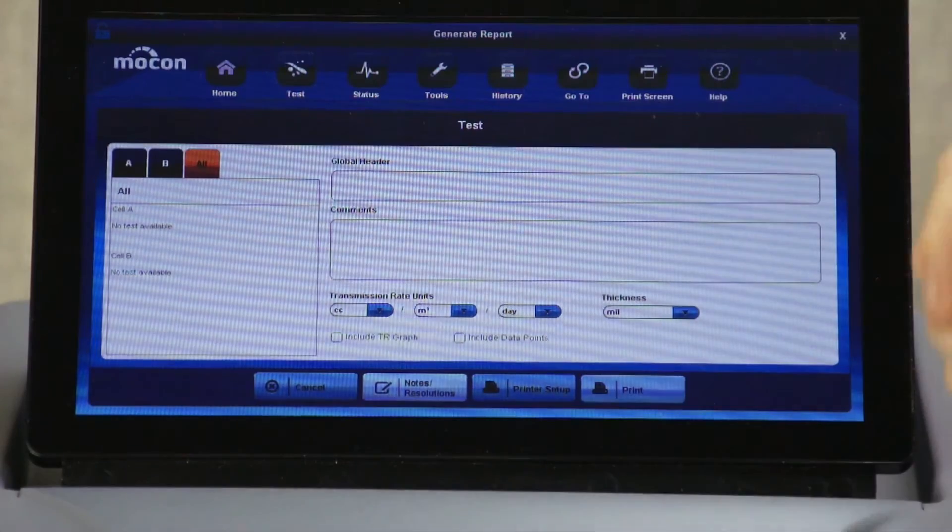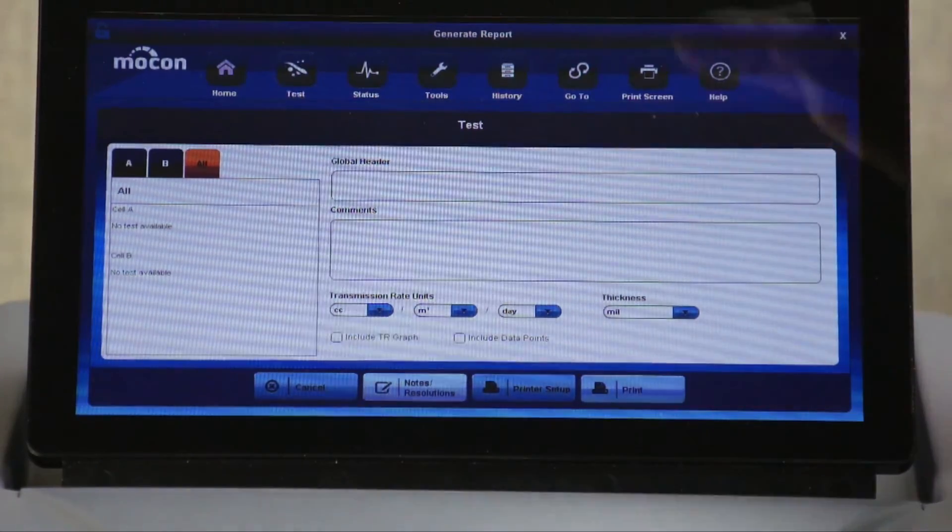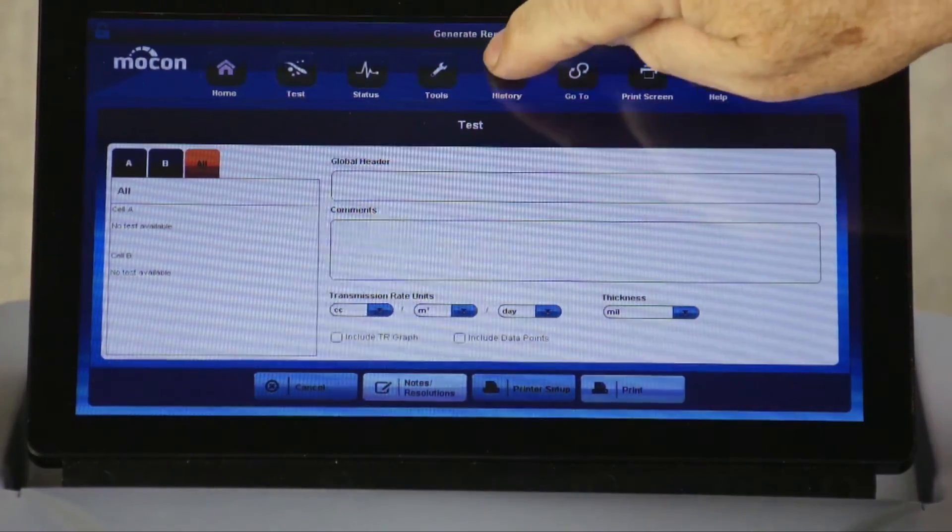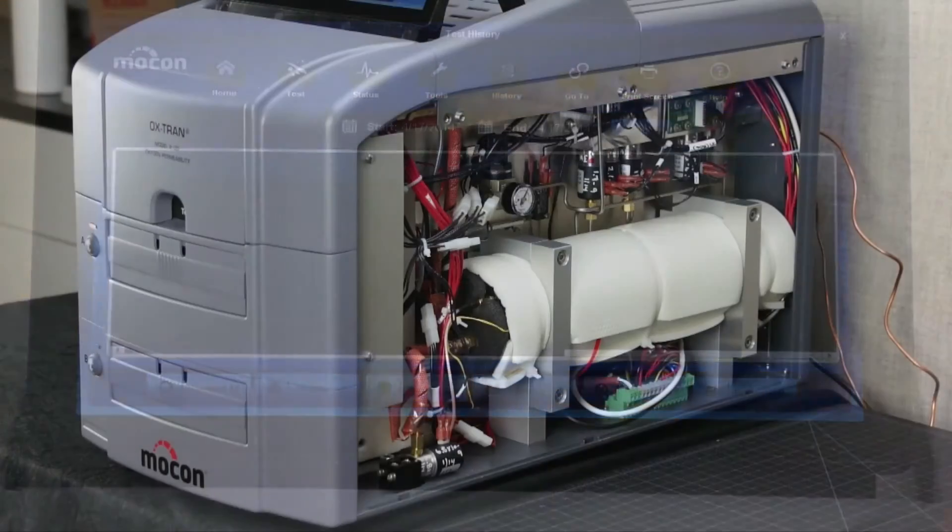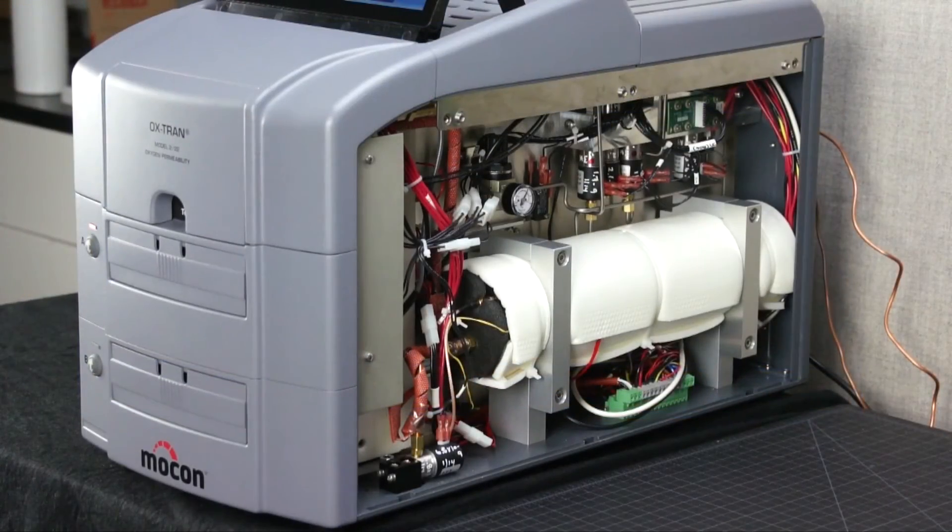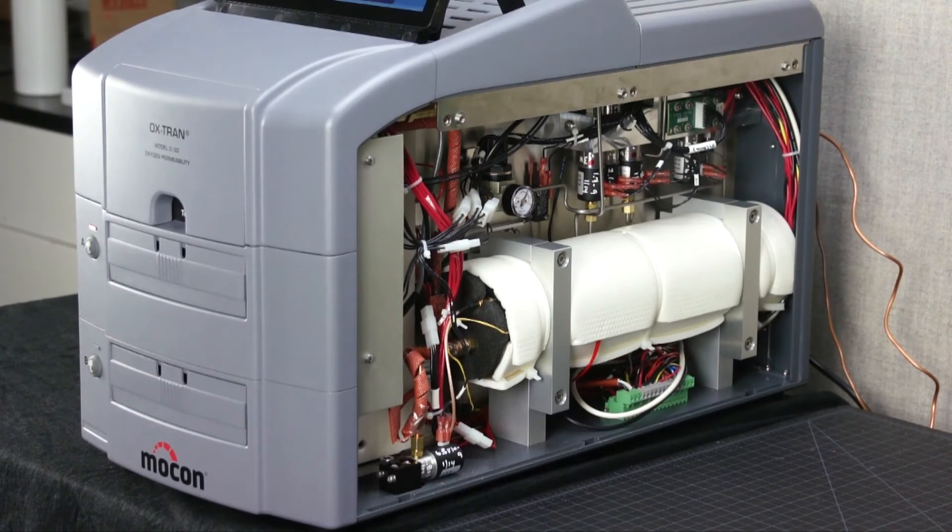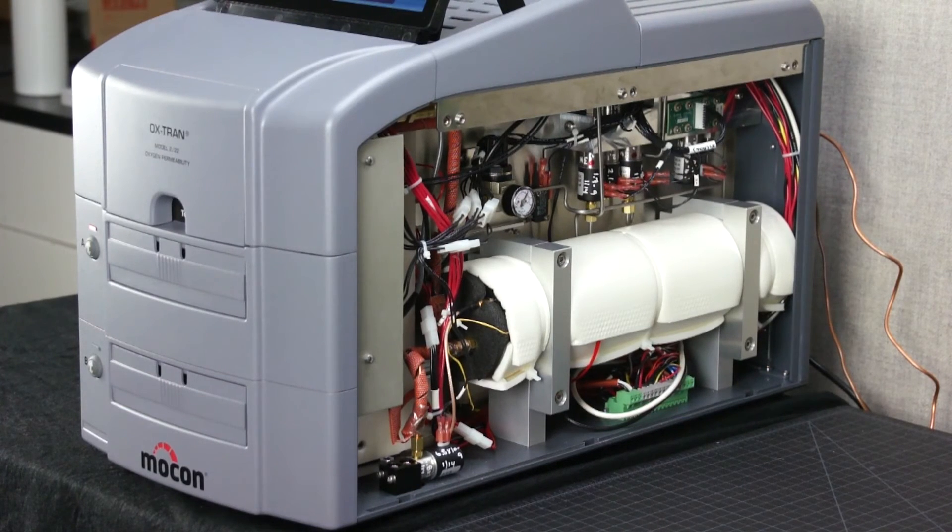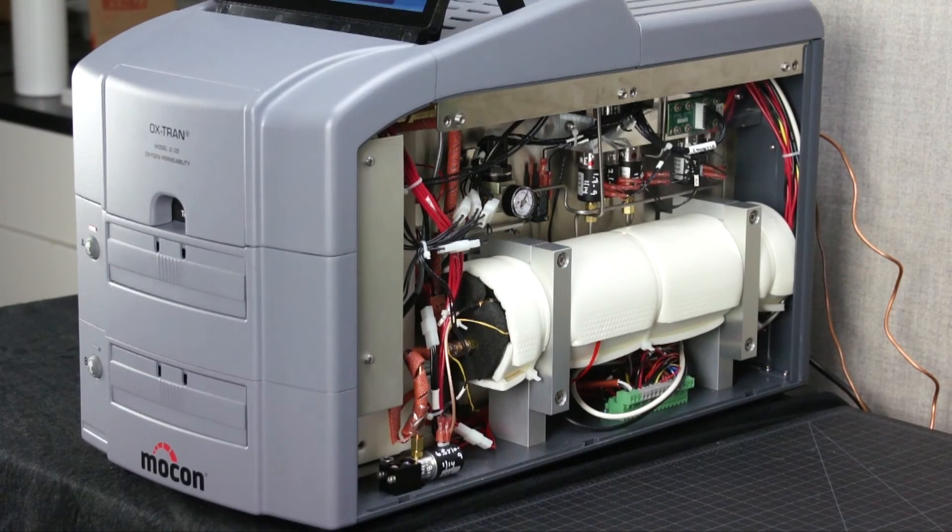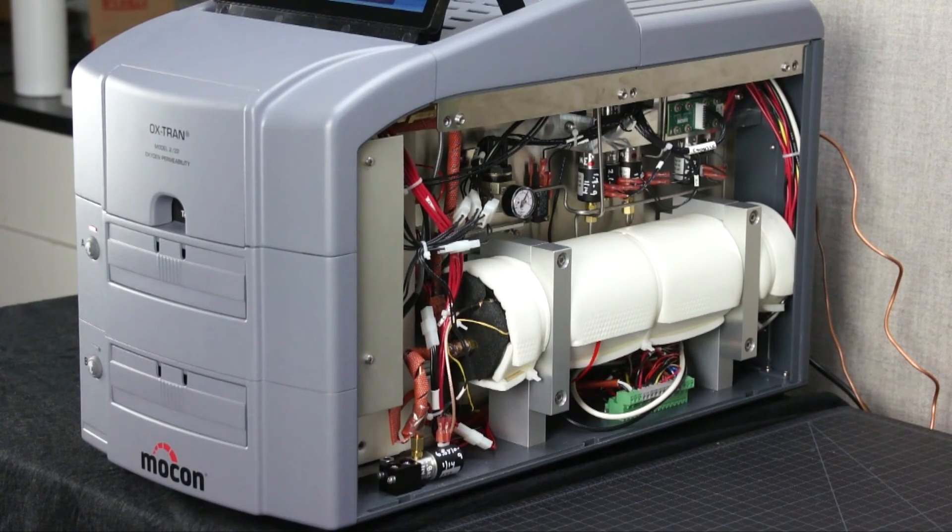Test results can always be accessed via the history menu. An improved Kulox Coulometric sensor with faster response time has been developed for the OXTRAN 222.